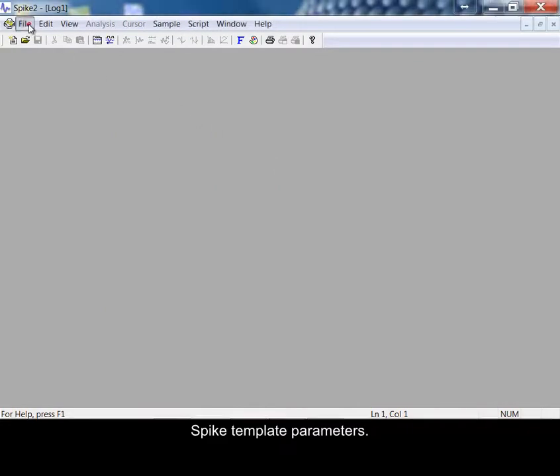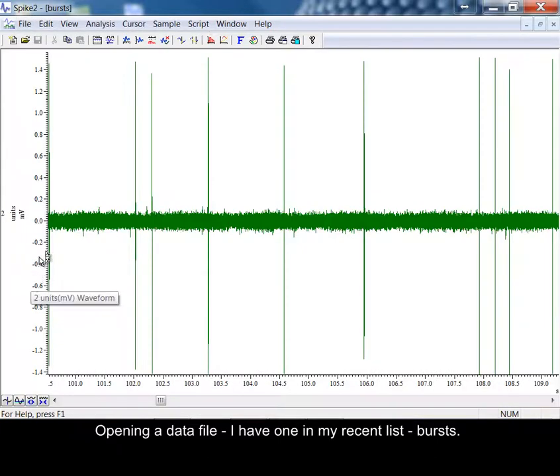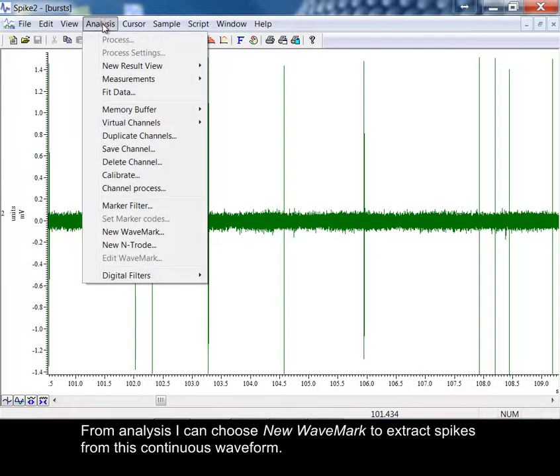Spike template parameters. Opening a data file, I have one in my recent list, Bursts. From analysis, I can choose New Wave Mark to extract spikes from this continuous waveform.